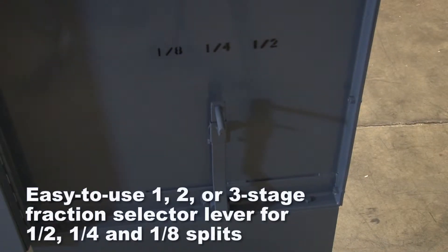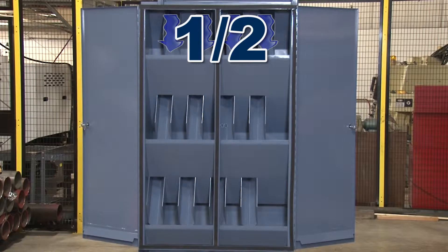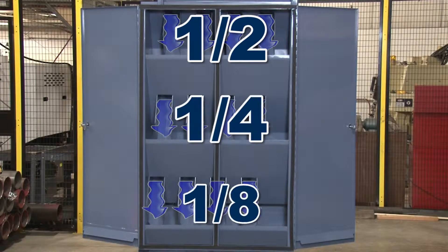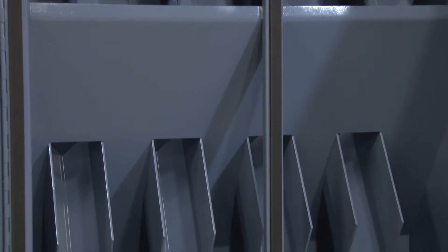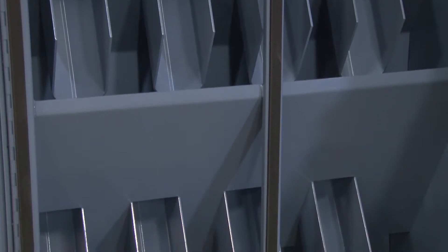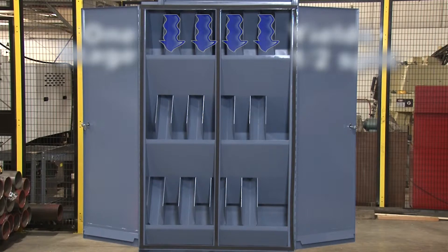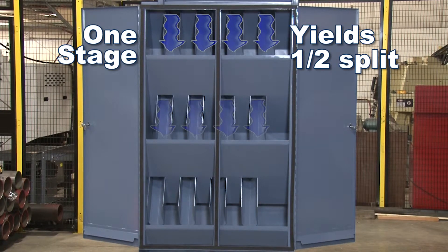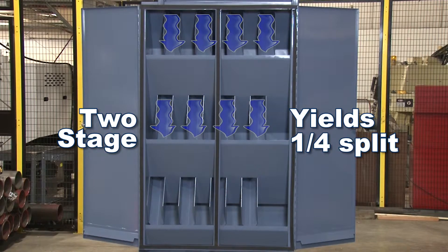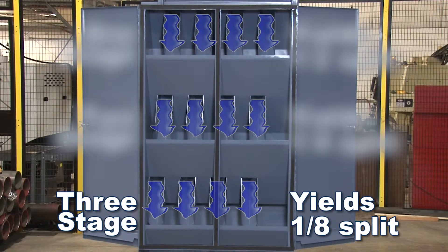These high-capacity splitters will process a bulk sample through an exclusive three-stage design into fractions of one-half, one-quarter, or one-eighth within a single pass. At each stage, half the material is directed into a reject pan, and the other half continues on to the next stage. A one-stage operation yields a one-half split, a two-stage operation yields a one-quarter split, and a three-stage operation yields a one-eighth split from the original bulk sample.